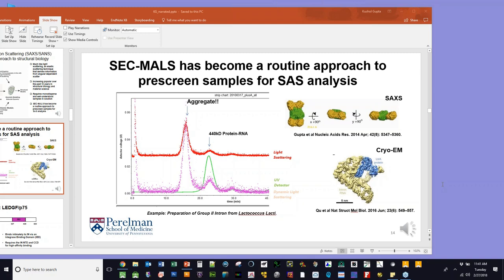I'm not actually sure about this question, but maybe you'll understand it. Does the elution time say anything about the health of a monodispersed protein? I think the elution properties do say some things. And so one thing to consider, and I see very frequently, this goes hand in hand with the SEC-MALS analysis, is that the breadth of the peak as a function of concentration is usually very diagnostic about associating species.